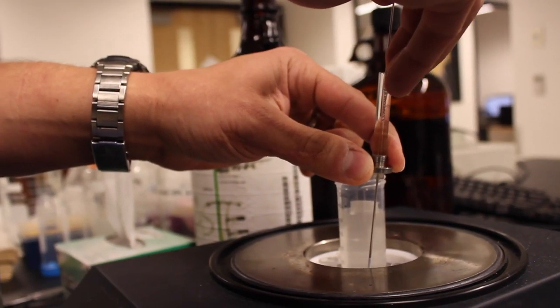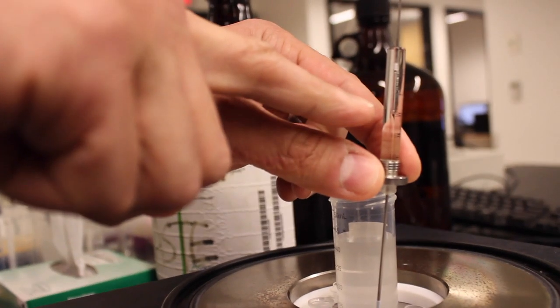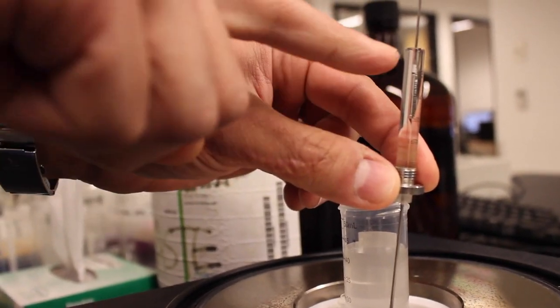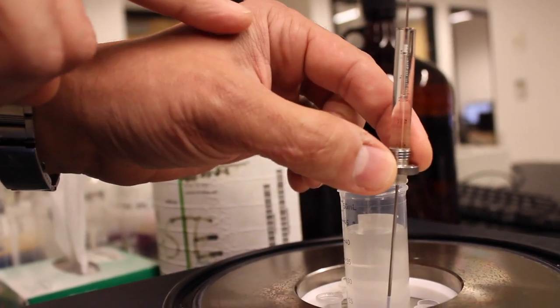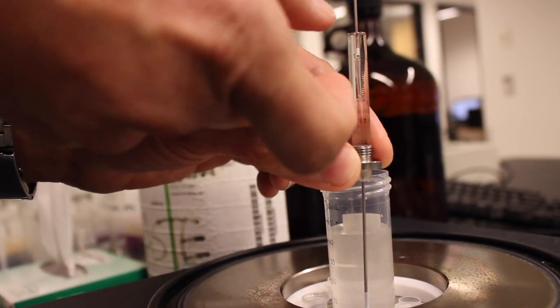What you will see is the solution is drawn up but there's quite a large gap between the top of the liquid and the plunger. So we need to reduce that gap. We want the gap to only be about one millimeter in size.